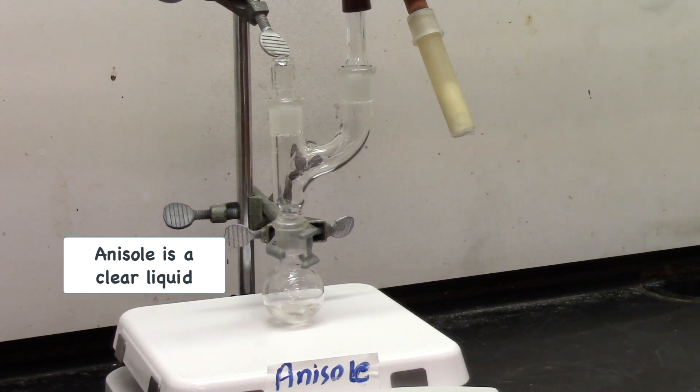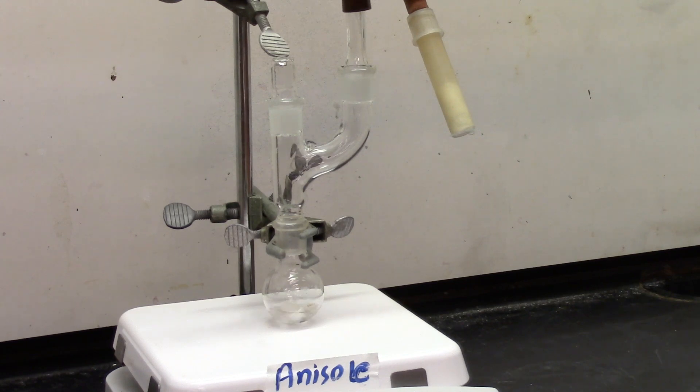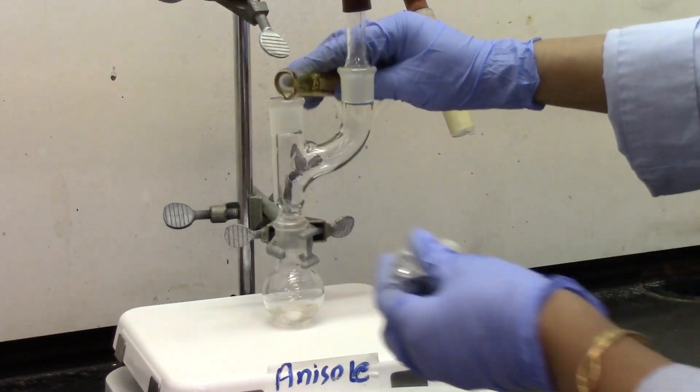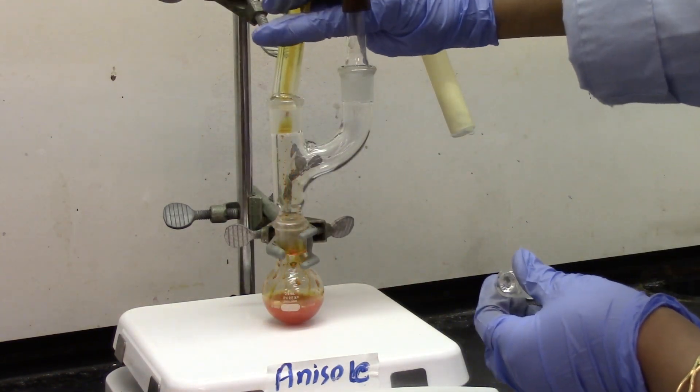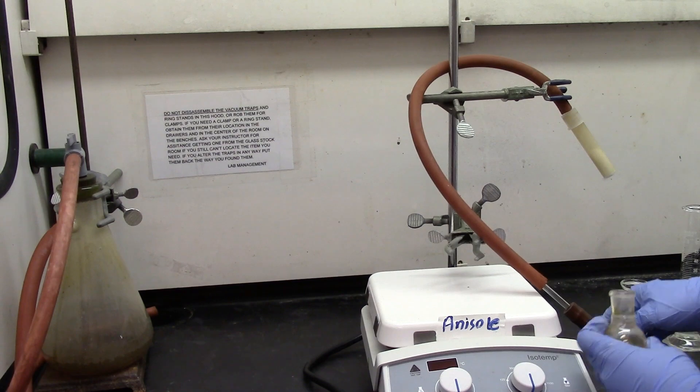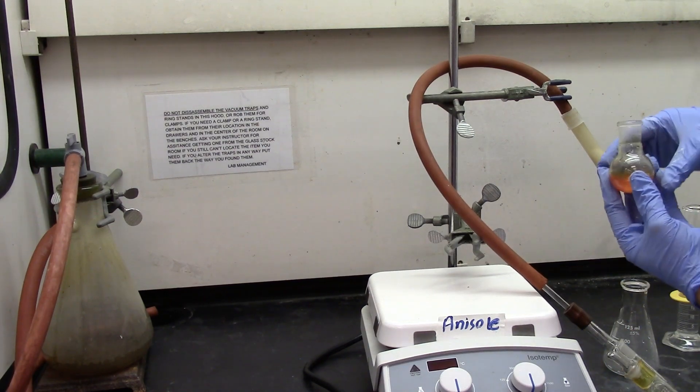So this is my anisole reaction where anisole is stirring with the glacial acetic acid. Now I'm going to add my 5 ml of bromine HBr mixture. The anisole would be stirring for about 30 minutes. It takes a little longer to react compared to aniline and acetanilide.